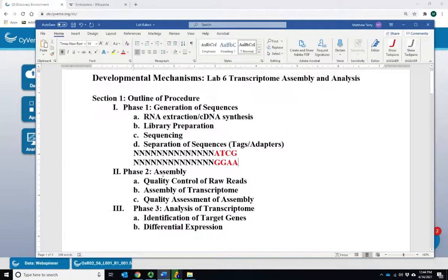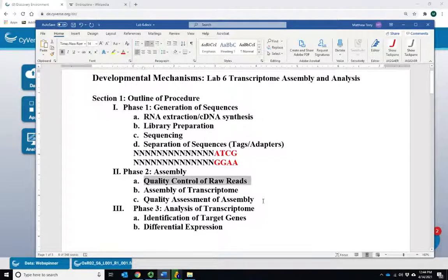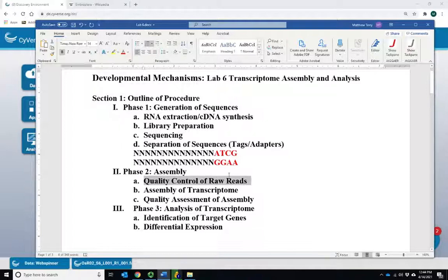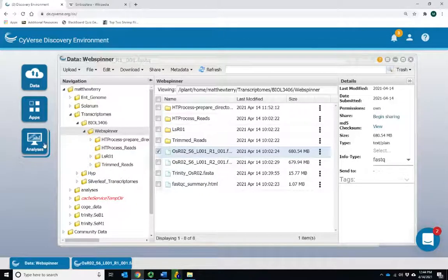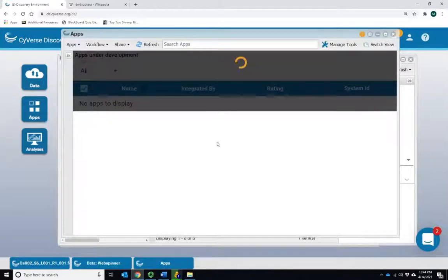We run the sequences through a program that looks at the sequence quality scores and does some other metrics on the sequences themselves. For instance, if you're seeing lots of sequences with all T's and C's and very few A's and G's, there's probably something going on — we would expect those nucleotides to be roughly equally independent. On the discovery environment, we have data we can store, share with collaborators, and apps we can use to analyze data and look at the results. One of those apps is a quality control assessment.